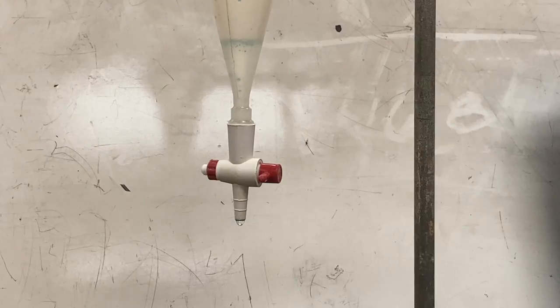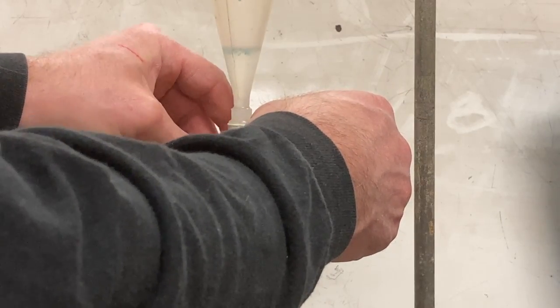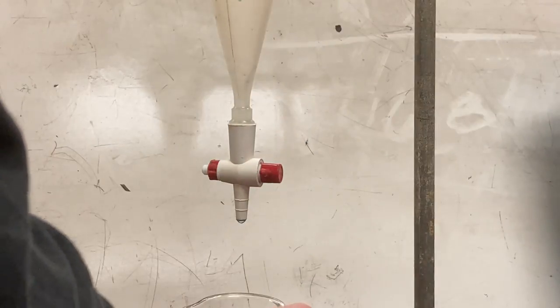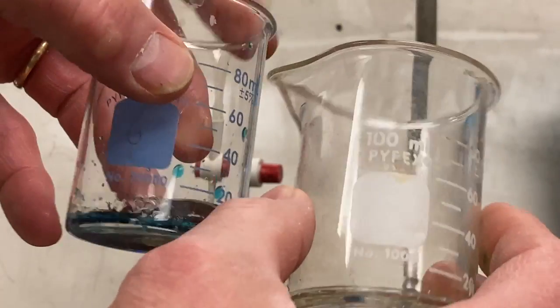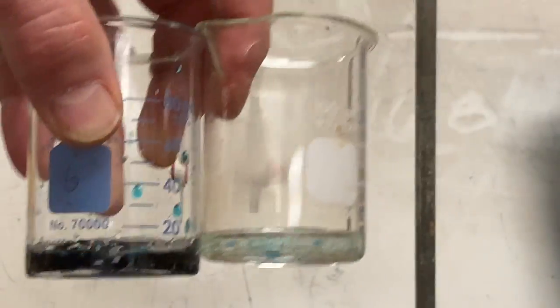And then if I want to catch the stuff that's on the top layer, then I just open the valve and catch the rest of it. Now this won't result in complete separation always. So you have to decide which layer you want to be more pure and either stop a little bit early if it's the lower layer you want to be pure. If you want the upper layer to be pure, you stop a little bit late. But by looking at these, you can see we had pretty good separation of the two substances.